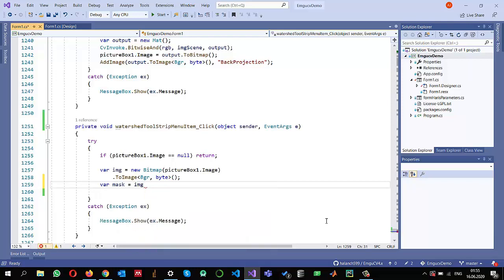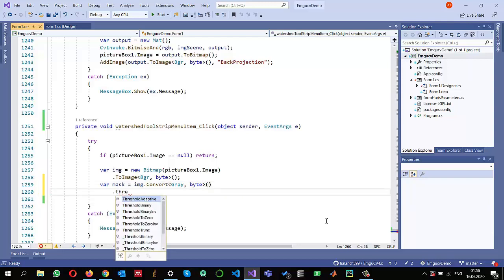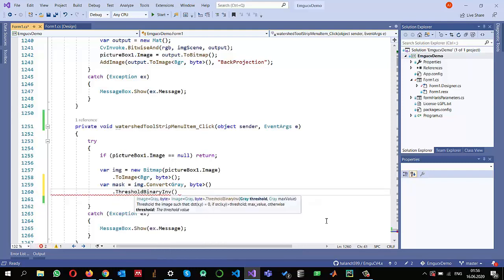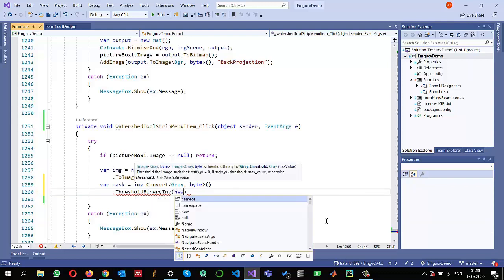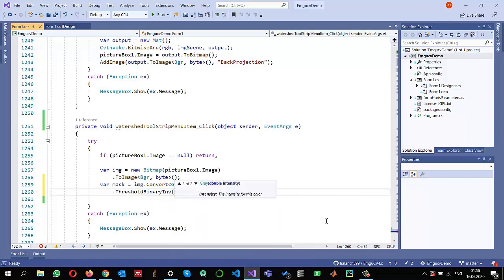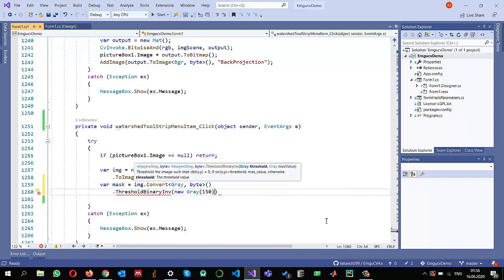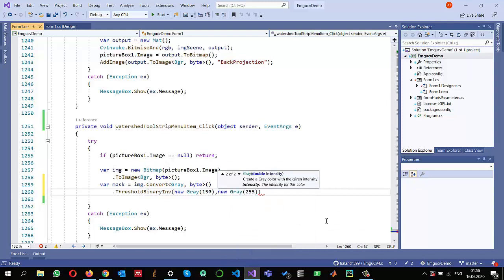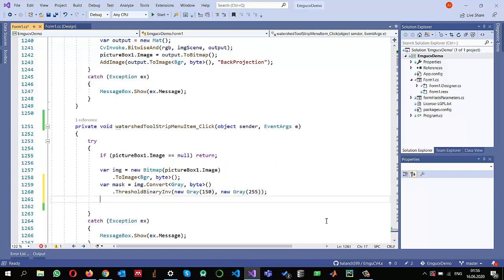I convert to gray with depth in bytes, then apply thresholding. Because my background is white, I will use inverse thresholding. I'll select a threshold value of 150 — if the pixel value is less than 150 I want to replace it with 255. Once this is done, I can apply the distance transformation.